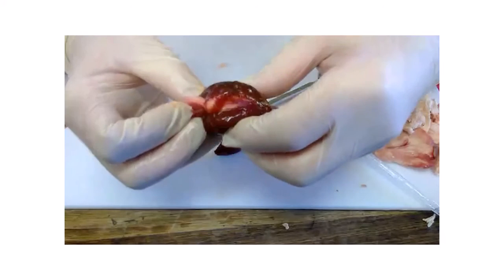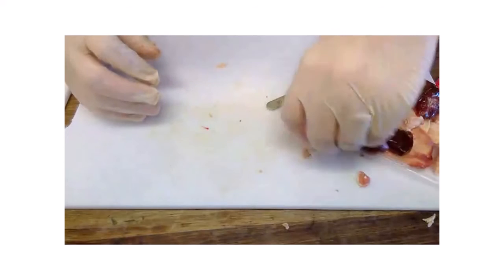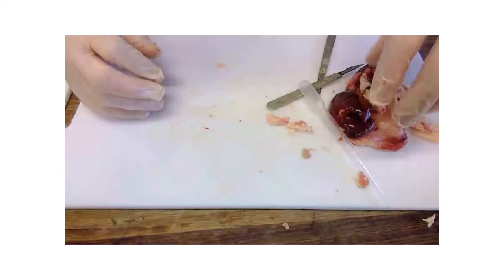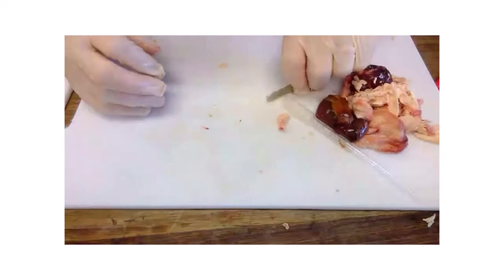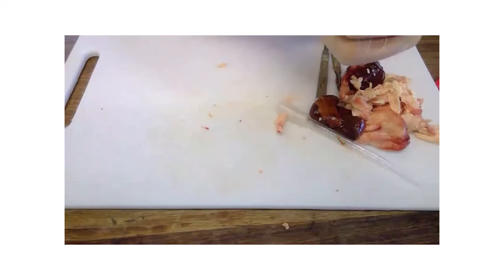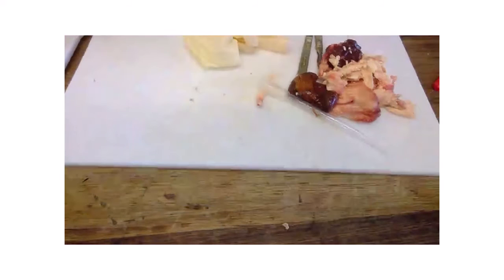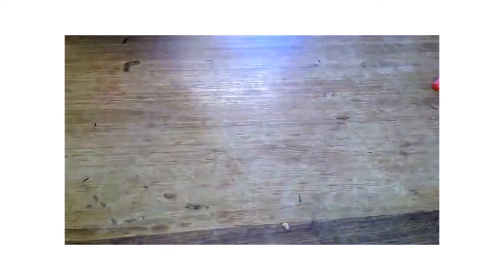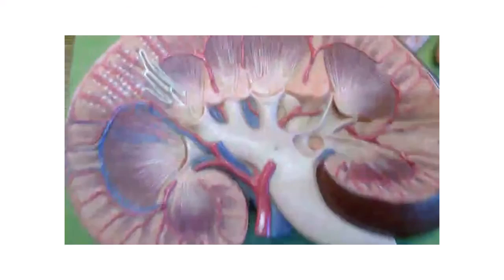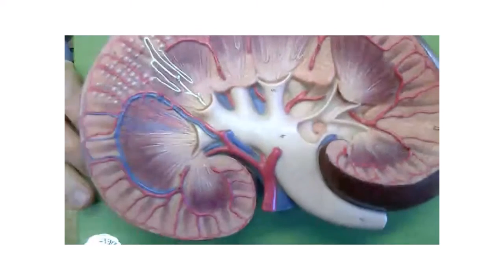So let's have a look now at the more microscopic structure of the kidney. As I say, I'll have that for my lunch later. That'd be nice. Kidney sandwich. Simmons, where's our sandwiches? Simmons, you owe us all sandwiches. Simmons asked about my sandwich like a month ago. Yeah, sure. Right, guys.